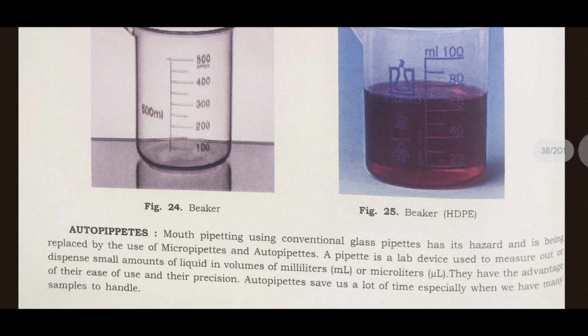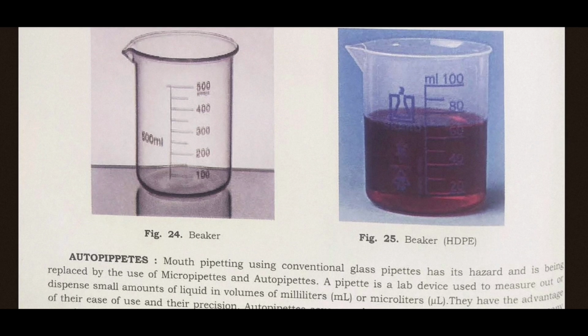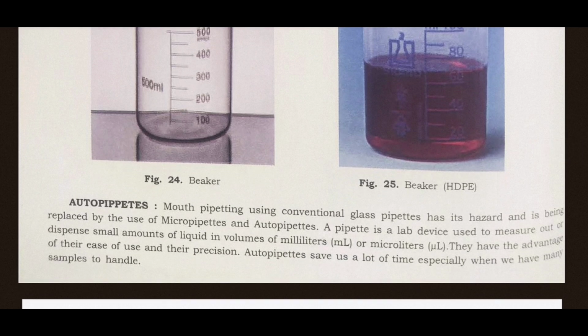Beaker, HDPE. Autopipettes. Mouth pipetting using conventional glass pipette has its hazards and is being replaced by the use of micropipettes and autopipettes.